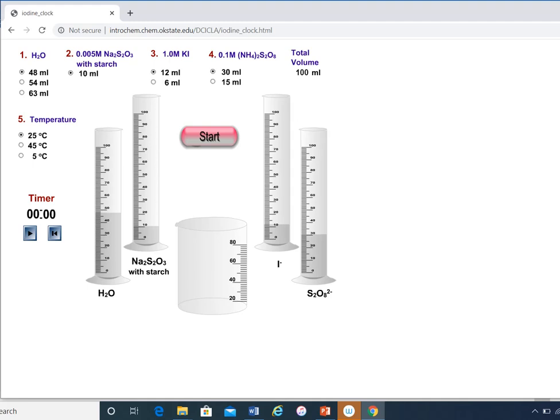This is what you're going to look at. So you have toggle buttons for water. This is the thiosulfate, S2O3 2- with starch, and it doesn't have a toggle, so the volume of this is always going to be 10 milliliters. This is KI, and I have two volumes here to choose. I have the ammonium persulfate, and I also have two volumes here. When I'm setting this up, my total volume has to be 100 in order for it to start the experiment. If you try to start it beforehand, it will give you an error.